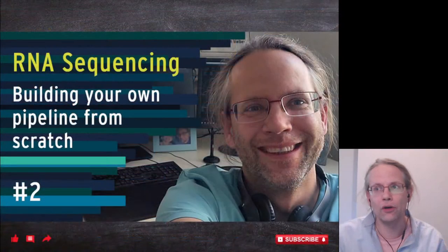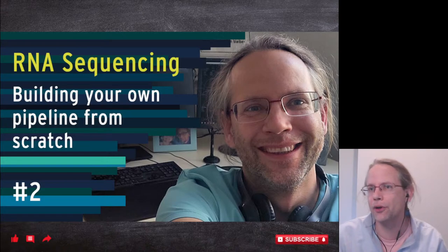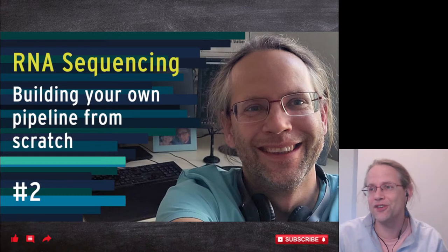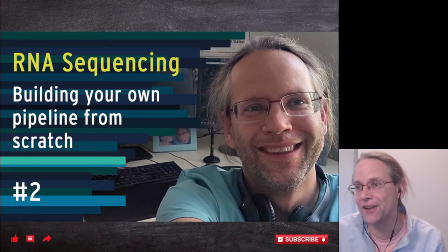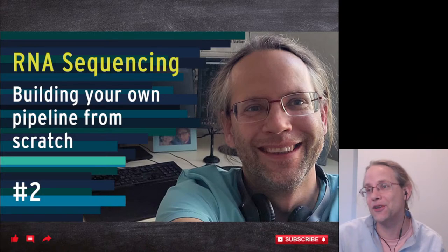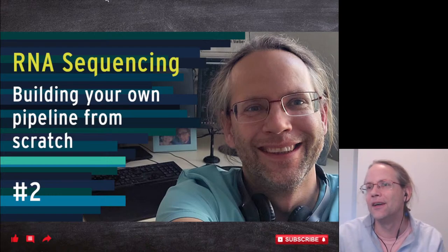So welcome. Another Sunday. We skipped last Sunday, and this Sunday we will be doing more RNAseq, building your own pipeline from scratch. I was a little bit disappointed by the previous time. I was expecting to get a lot further, but we were just installing programs and we didn't align a single read. So I hope that today we will actually start aligning reads, and that's what the whole lecture is focused on.